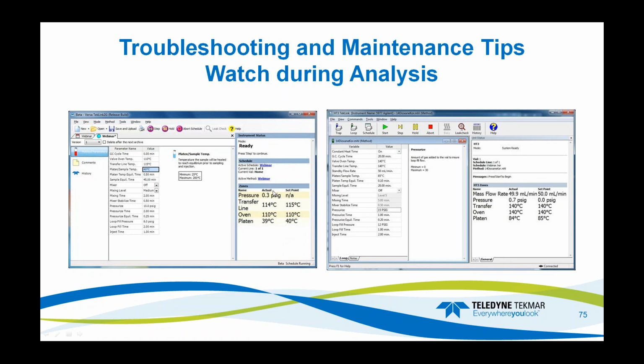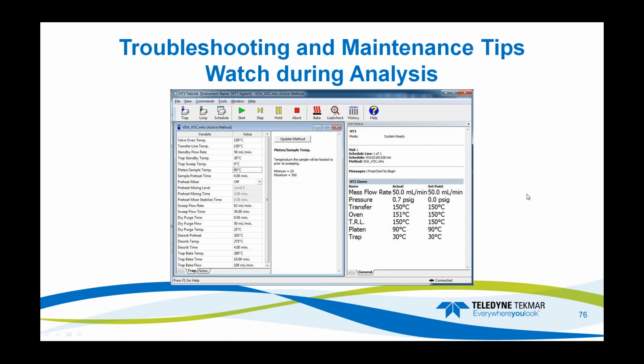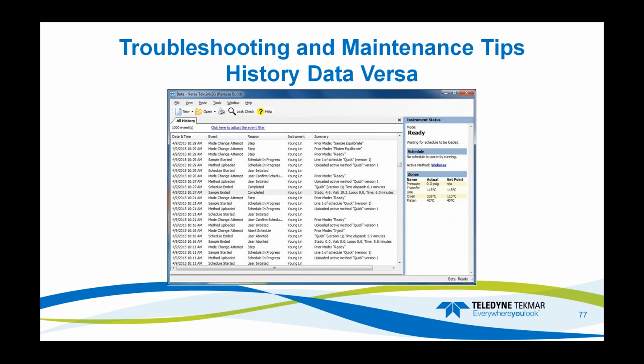Also, watching during analysis, what I'm suggesting is, while it's pressurizing the valve, is the pressurization performing properly? And we have those here that are automatically read during the sample analysis. Same thing with the HT3 during the trap. Are the pressures performing correctly? Is the trap heating up when it's supposed to? Those are all things that we show on the screen. So as you're watching, you'll be able to say, well, the trap didn't heat up hot enough. You come in, you find that your data doesn't look right and something went wrong possibly.